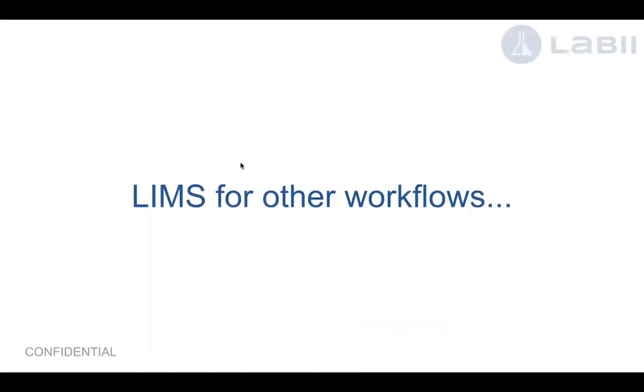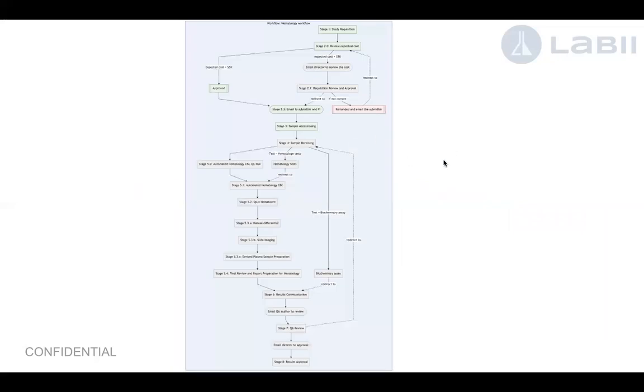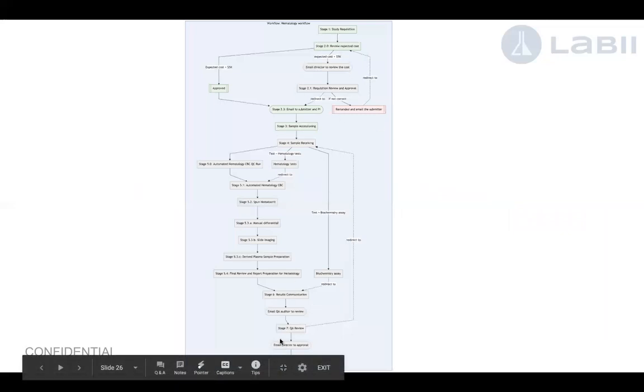And then, of course, the other workflows can also be used. For example, the deep sequencing. And the thing I do know from my own experience is that in every lab, the workflow is different. Even for the same kind of steps, the workflow is totally different. So we enable you to customize it just based on your own needs. So this is one of the examples of the customization. It's at a great level of detail from stage 1 all the way to final approval. In every different kind of situation, how it needs to be handled.